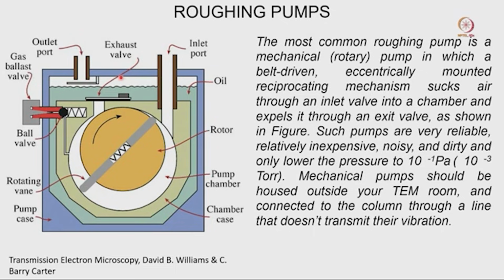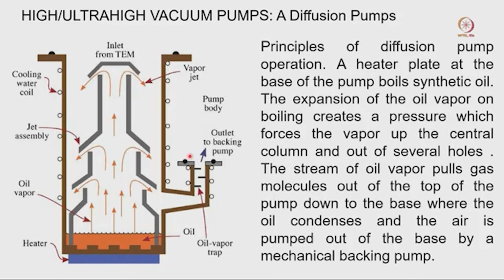But this pump is generally a very noisy pump. Generally it should not be kept with the microscope because there will be vibration from this pump, which is going to affect our imaging system. What is the next pump? As we mentioned, the next pump is the diffusion pump, or it is called the oil diffusion pump.